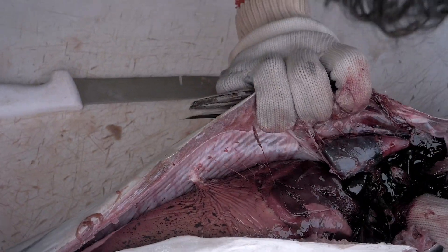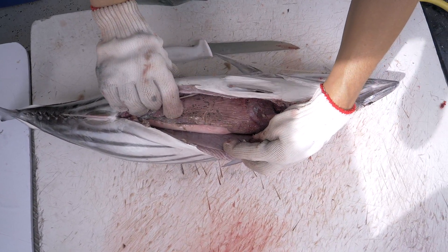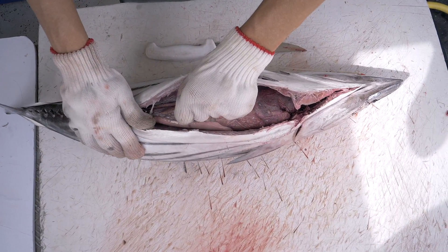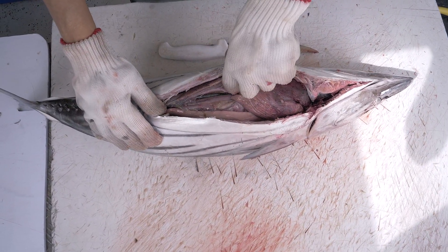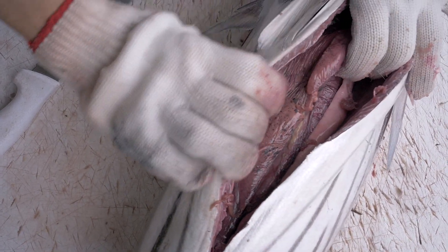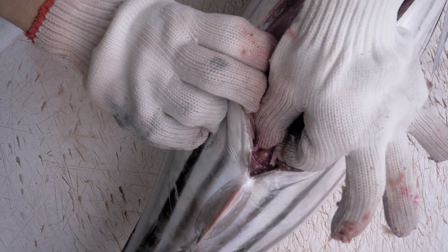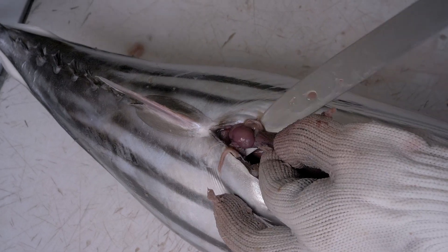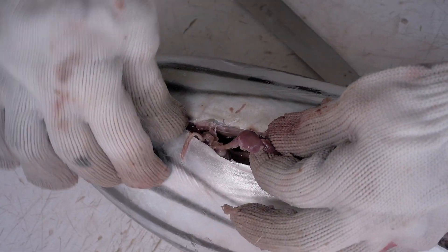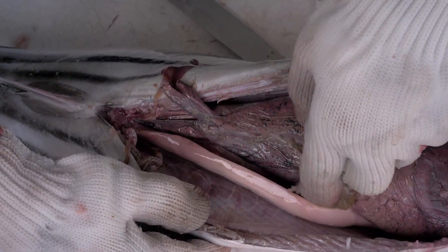Here you can see on top the liver, which has a darker color most of the time. Underneath you have the digestive system. If you remove the digestive system, you will see the stomach underneath. The intestine is attached here, and it's easy to identify as it will be attached to the fish's anus. If you look deeper, you will find the gonads against the backbone.